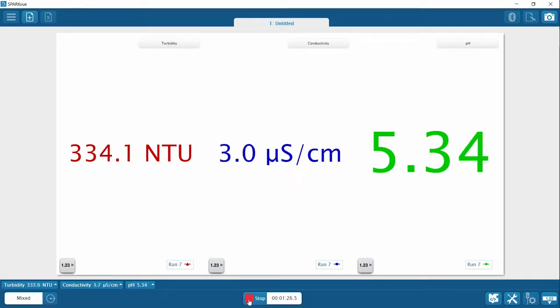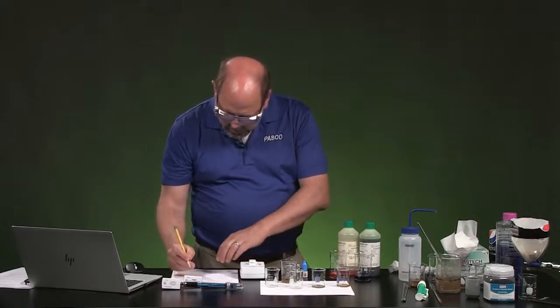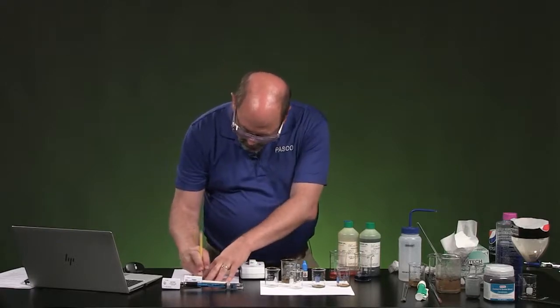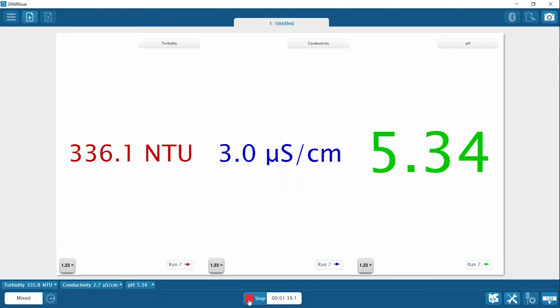Activated charcoal. Oh, I put this in the wrong slot. Let's get the correct space there. Let's put the activated charcoal filtration as 336.